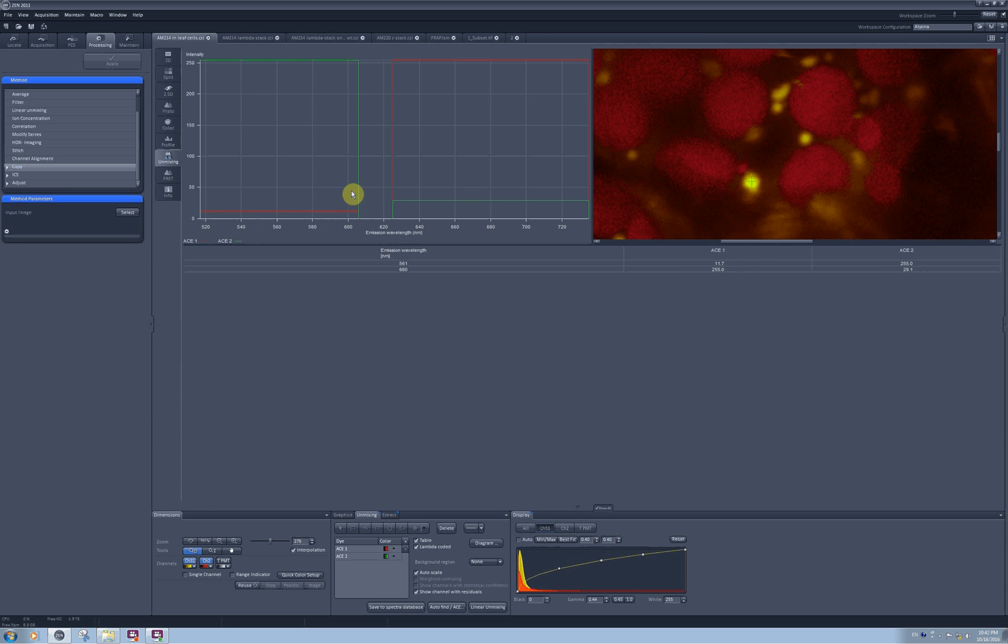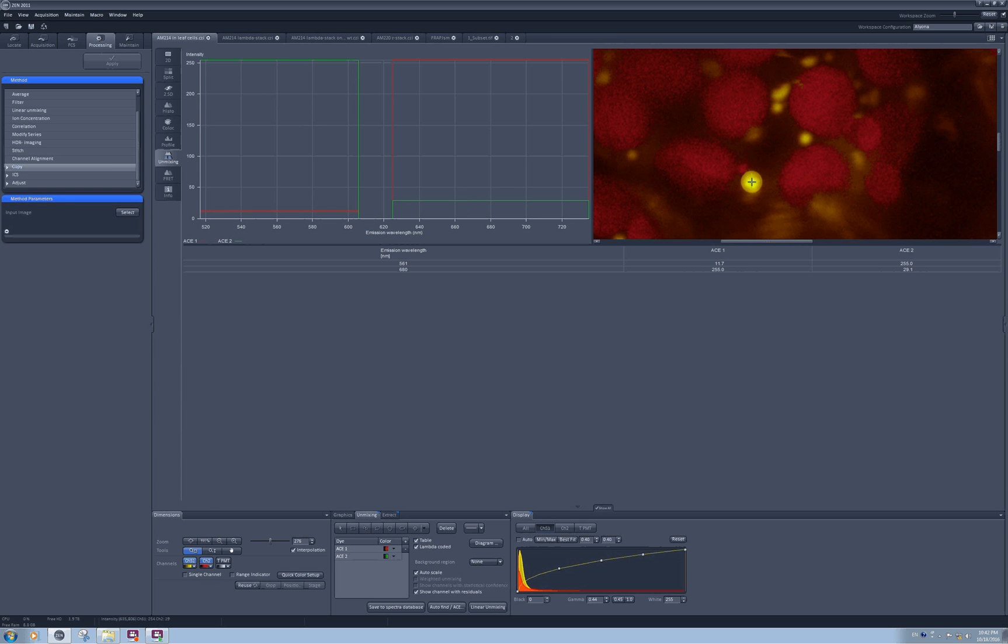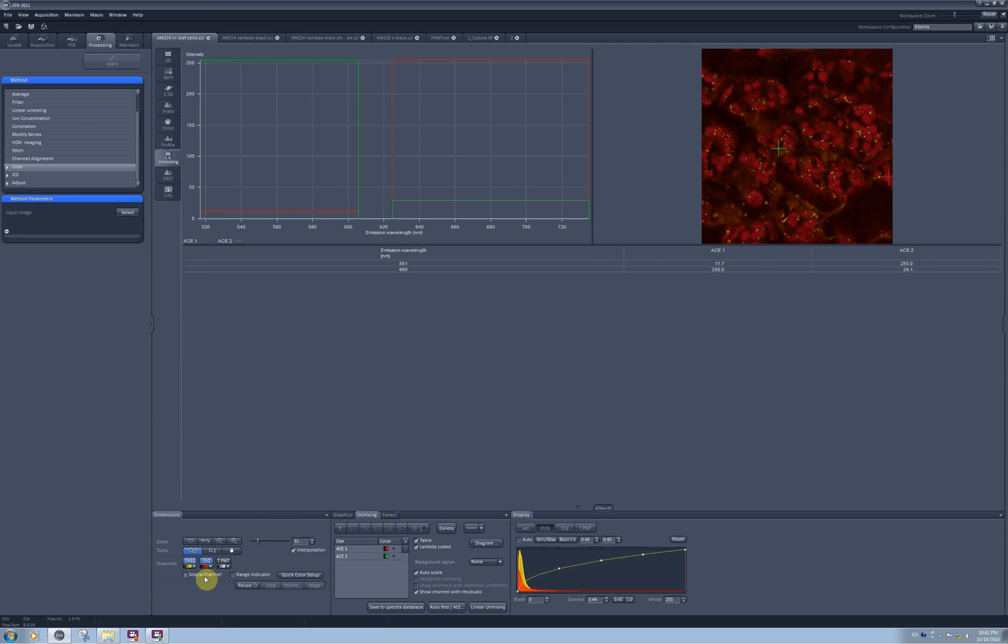This data was plotted here. This was the range which I was detecting in the GS1 channel from 515 to 610. The intensity for each wavelength is plotted as one value because it was summed up on the detector. Then the software did the same for channel 2. It looked for the area which contains highest possible intensity in the channel 2 and it found the spot here.